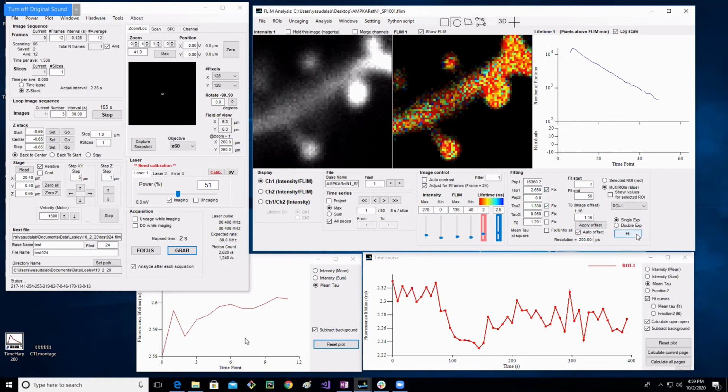So you fit those two values, and then what I'm going to do is fit my lifetime curve, okay? By clicking this fit button. Okay, and when you do that, it populates a good fit for these other two values, tau G and tau 0, okay? Tau 0 is basically a measure of what we call the offset, or you can think of it as the system response function. Tau G is also a measure of the width of the Gaussian of this system response function.